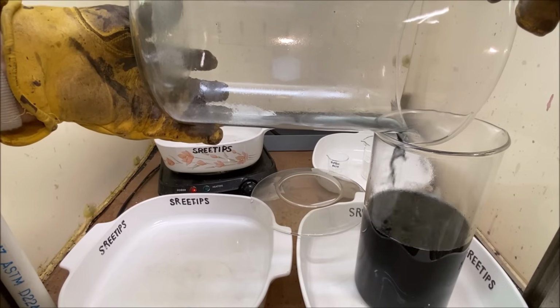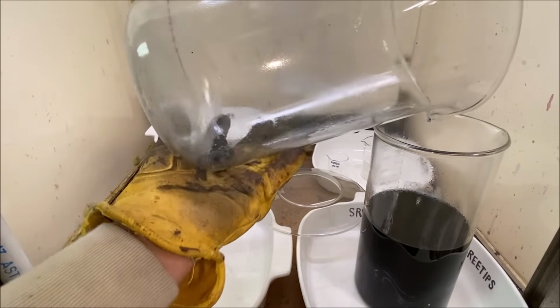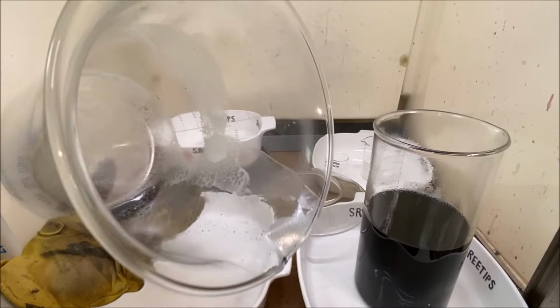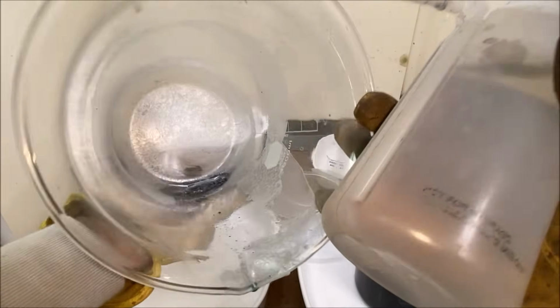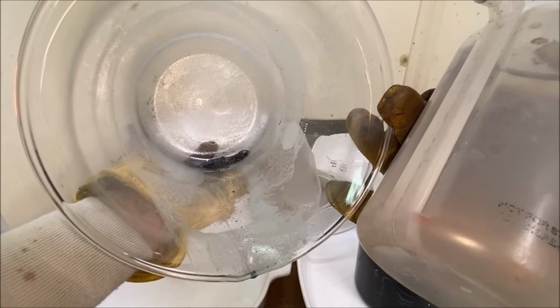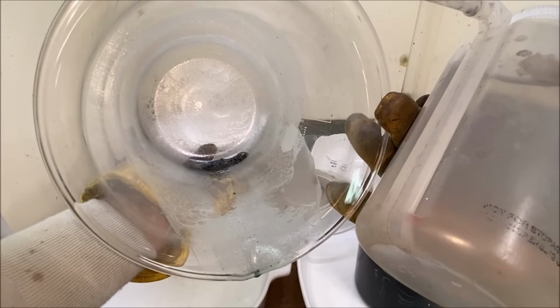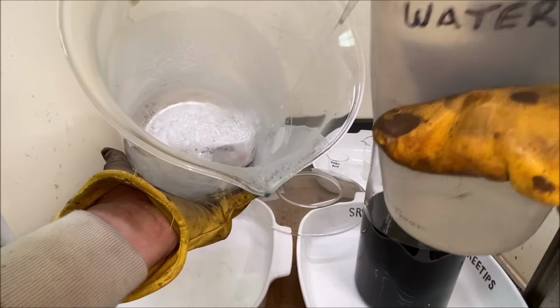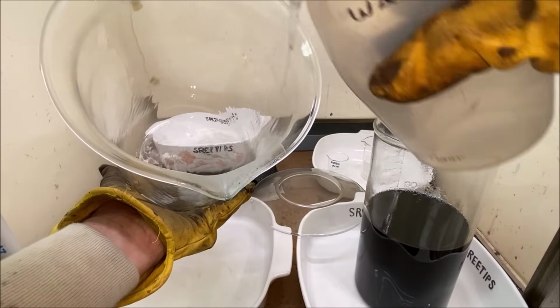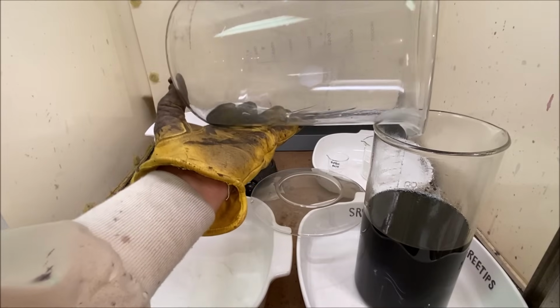I don't have a whole lot of solids down there. Can't really see what that is, but it does not look like silver. You can see the silver forming on the inside of the beaker from the heat of the beaker. See the silver nitrate coming out of solution, forming crystals. That's a pretty neat sight. I'm going to rinse this all out. We're going to add this to the tall beaker. See if we can get this to settle out.